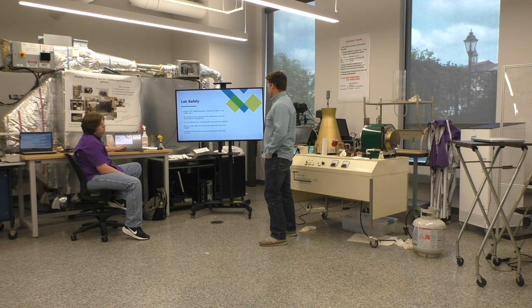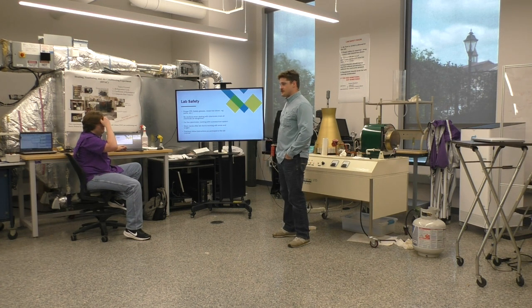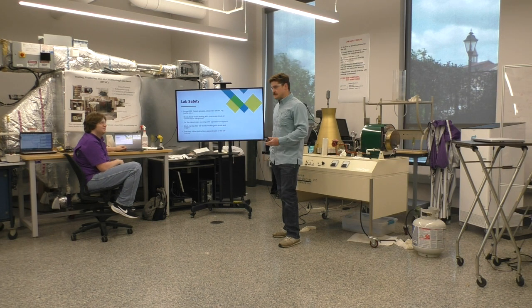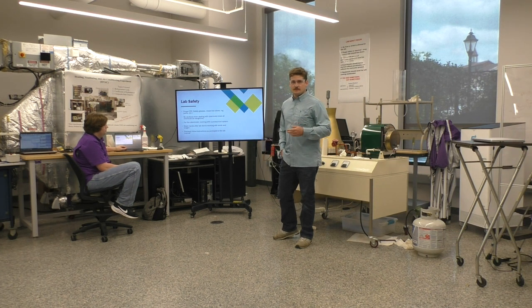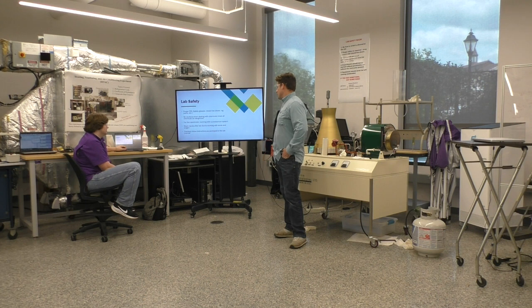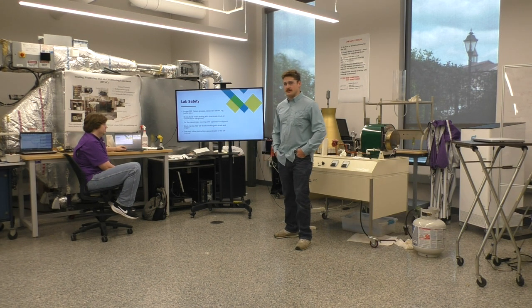We want to be safe because this is a possibly dangerous lab. You want to wear your safety glasses, closed-toed shoes, and pants, and be cautious when dealing with chemicals like benzoic acid. Just be cautious generally. And for the calorimeter, wear safety glasses because it's a pressurized system. Who knows if the top can pop off of it? Wash your hands afterwards after touching the benzoic acid and working with the oxygen, and precisely follow instructions as per the lab manual.